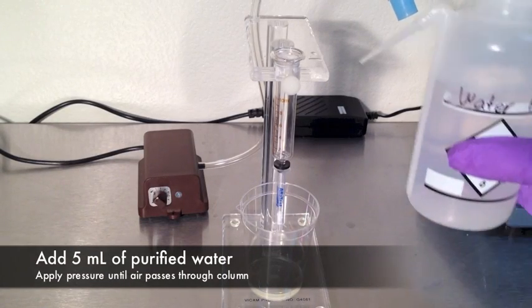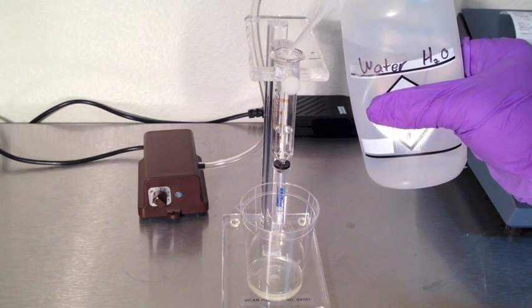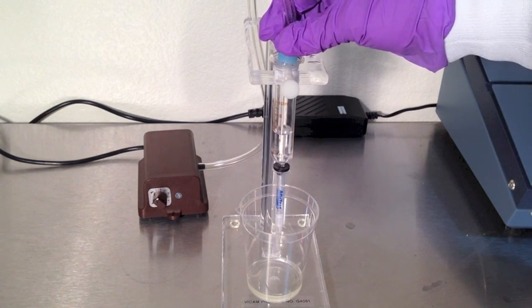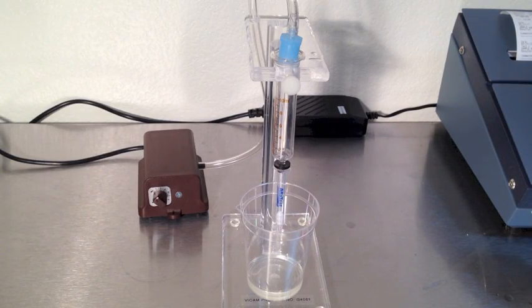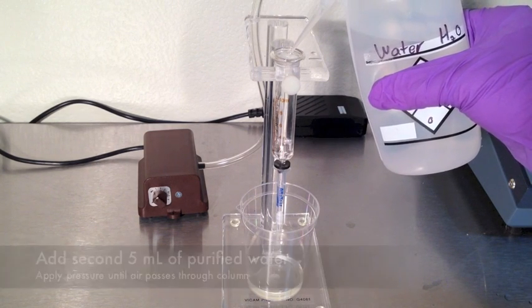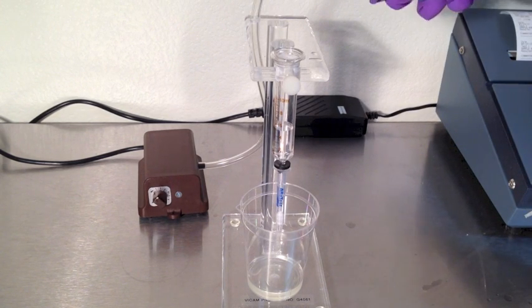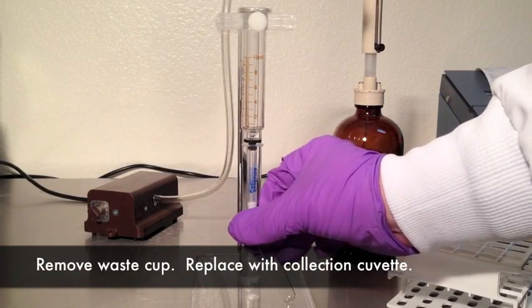Repeat the step again. Use the markings on the syringe barrel to add 5 milliliters of purified water. Apply air pressure to the syringe and pass water through the test column at 1 to 2 drops per second until air passes through the column. Repeat the step again. Add an additional 5 milliliters of purified water, then apply air pressure to the syringe and pass water through the test column at 1 to 2 drops per second until air passes through the column.